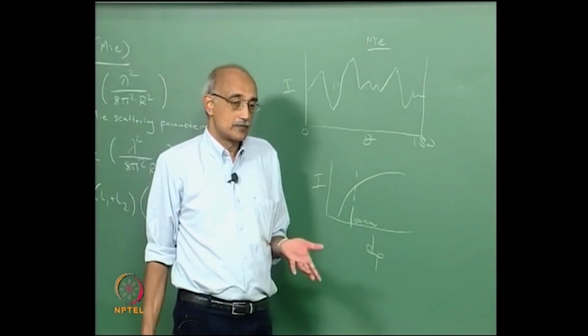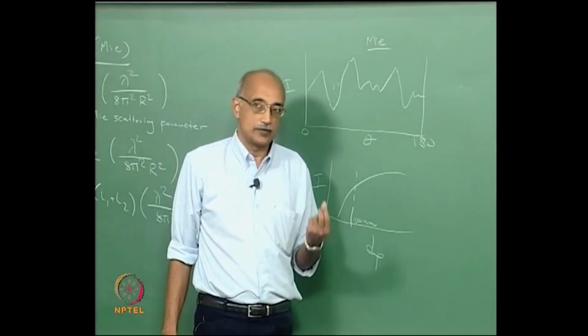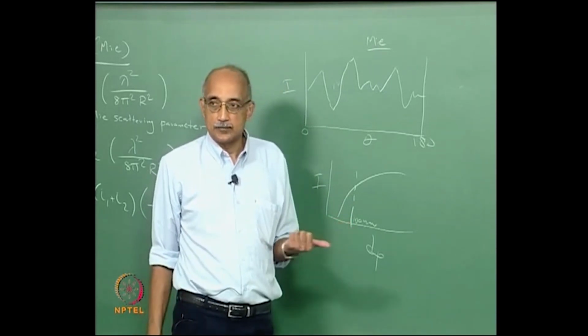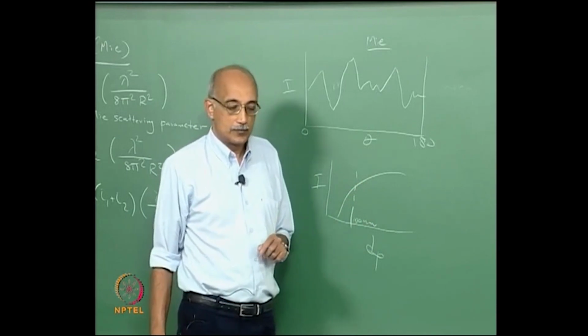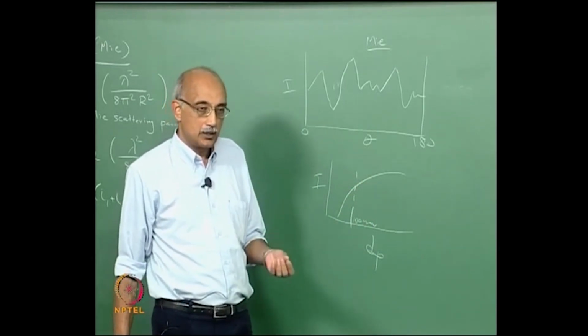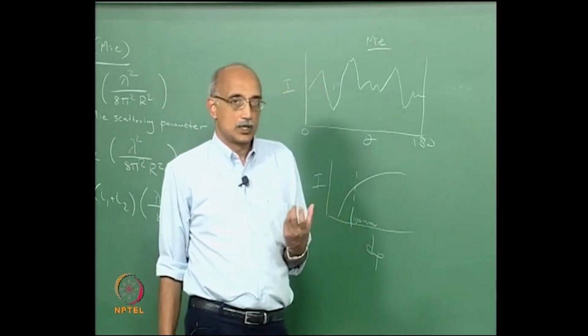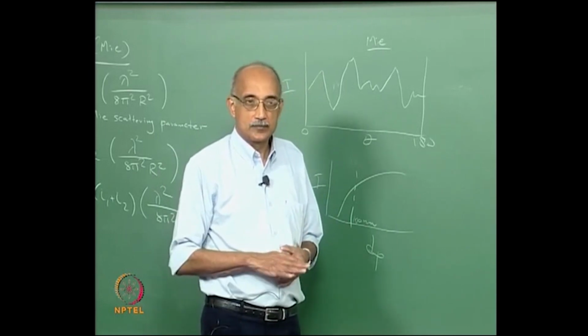One reason is in this size range, in the 100 nanometers and less size range, there are very, very few techniques that are any better than light scattering, even with the limitations that it has. And so you want to try and make light scattering work even for particles that are smaller. But how do you do it? Same question I think I posed in the last lecture.